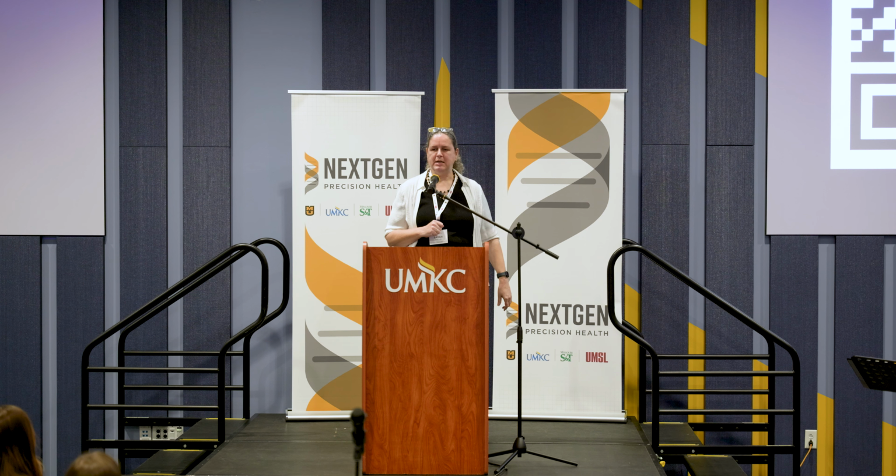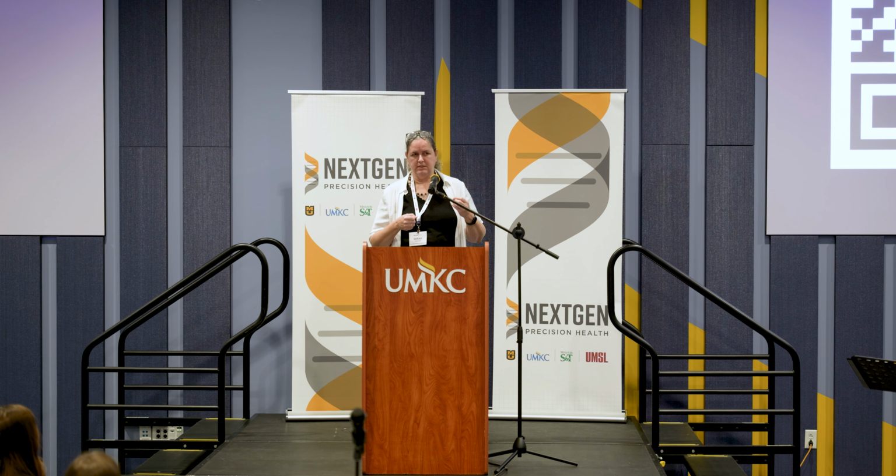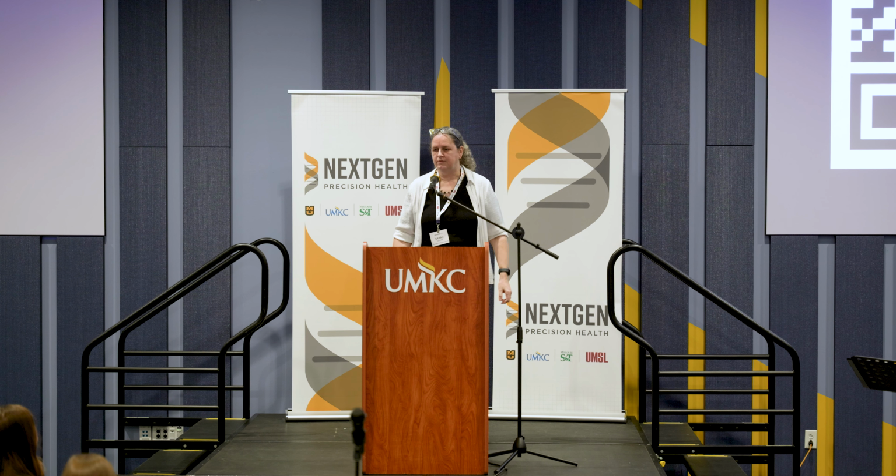So humans are still better in some regards, but now with the more sophisticated AI, particularly with the movies that have the nuclei tagged, we're able to track the cells in a more automated fashion, and you can train them to recognize the same nucleus. And now we're able to get data from all the cells instead of just picking 10, and all the cells that are emerging at different times. Once you have that data, it gives you a lot more opportunities for looking at the interactions of cells, and whether, when a cell meets another cell, it alters its trajectory. So there's a lot more data you can pull out of it.